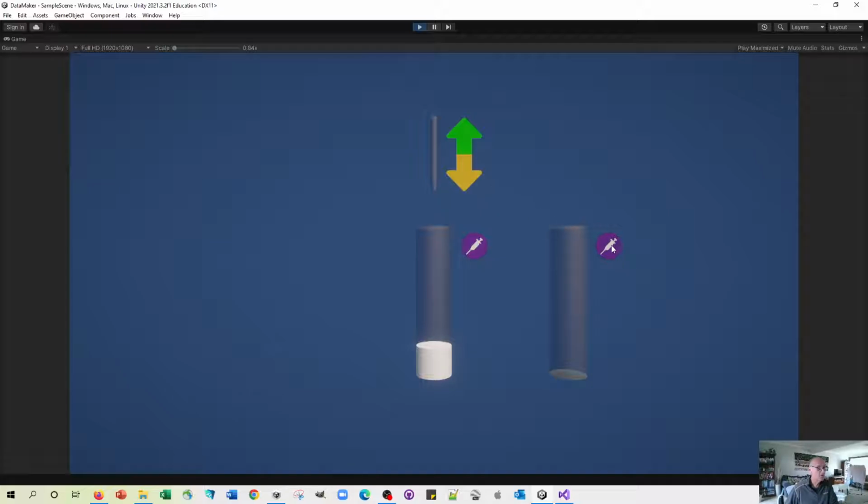So if I click on the little pipette guide here, press the down arrow, then we start getting some liquid being dispensed into the tube. If I press the top arrow, then we'll remove liquid. Obviously, we can't go beyond 0, so I can keep pressing that and it's not going to take things to less than 0. We can prove that by adding another aliquot, and this will take the volume up like it did before.